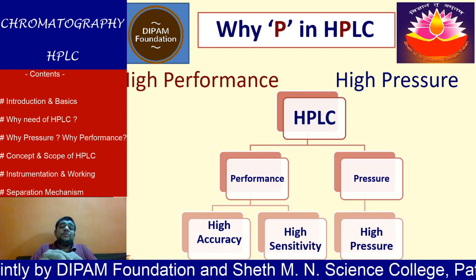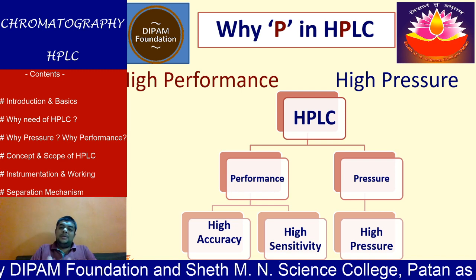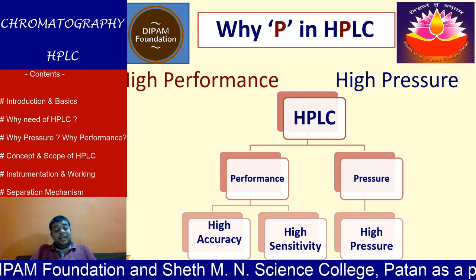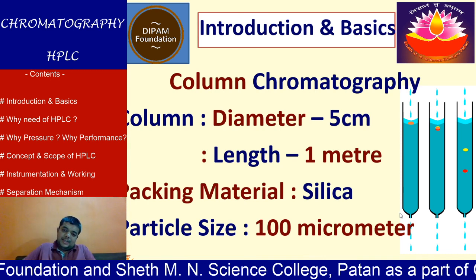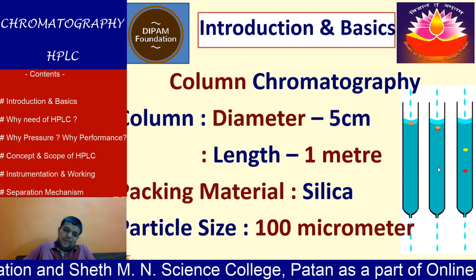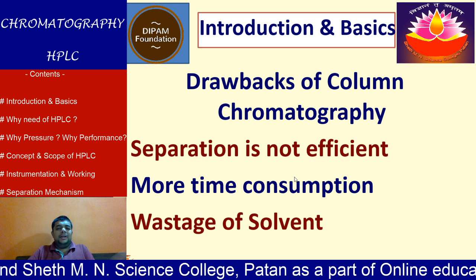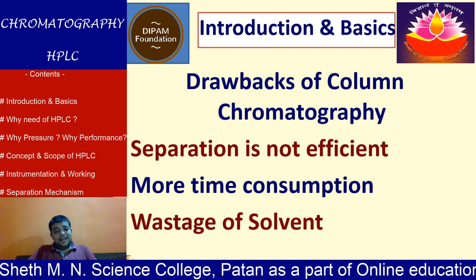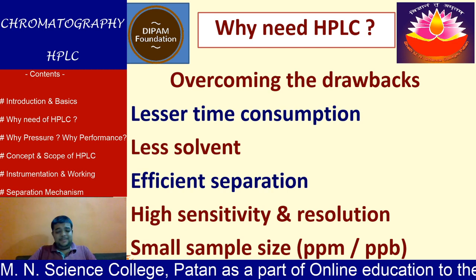A very important question to be addressed at this moment is why high performance, why high pressure? I told you earlier that in this column chromatography experiment, the movement of this orange mixture from top to bottom was all dependent on gravitational force, and hence it took a large amount of time.